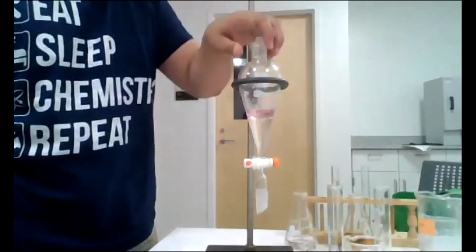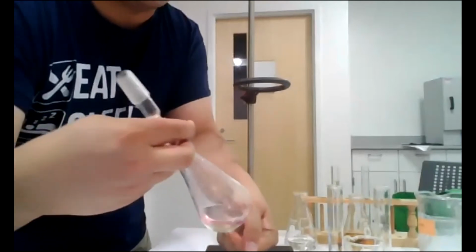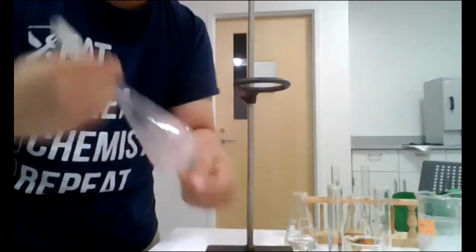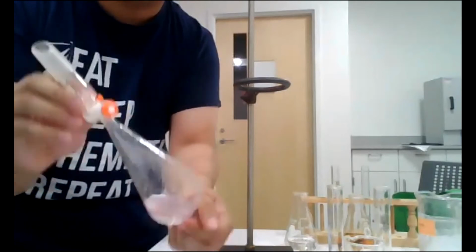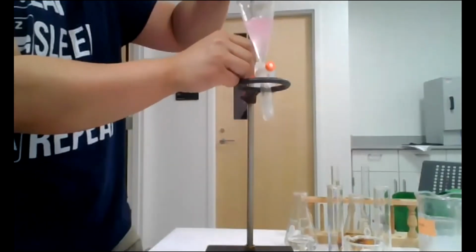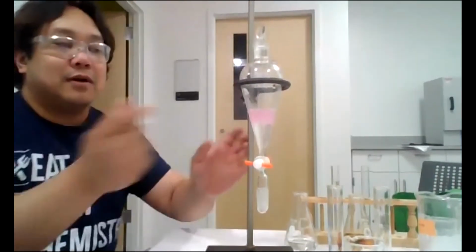So here's the stopper. Maybe listen very carefully. Maybe there's some gas. I heard a little bit, but not that much. Shake, vent. Let me move it towards me. Shake, vent, shake, vent. That is the second extraction. Well, let me say that is the second serving of cyclohexane.